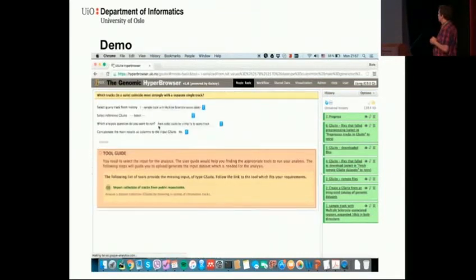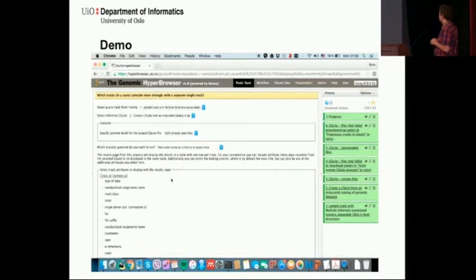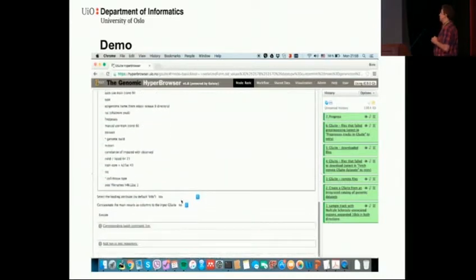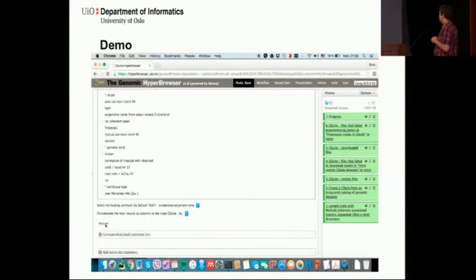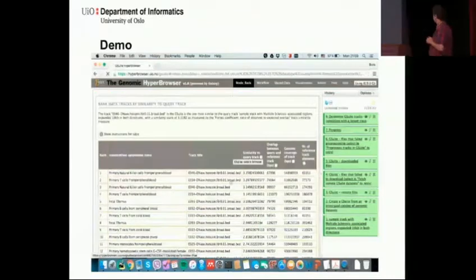We select the query track, the multiple sclerosis track, and then the collection of DNase hypersensitivity sites there. And this is displaying all the metadata that is available for these datasets in the database. We select the epigenome name as an important piece of information that we want to see in the results. I click execute, and this takes around a minute, so I just pause here, which is, I would say, quite fast for around 80 analyses.